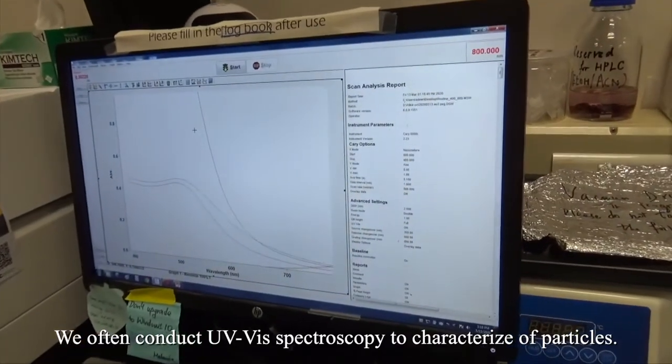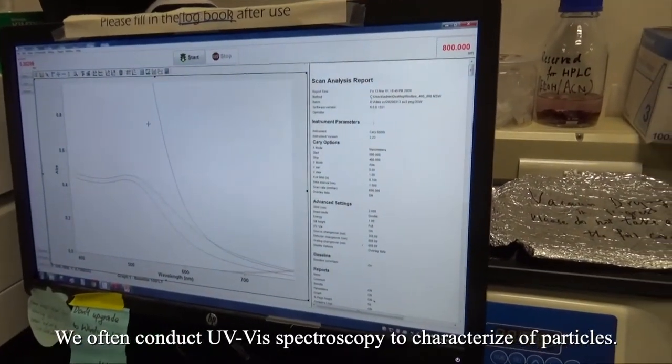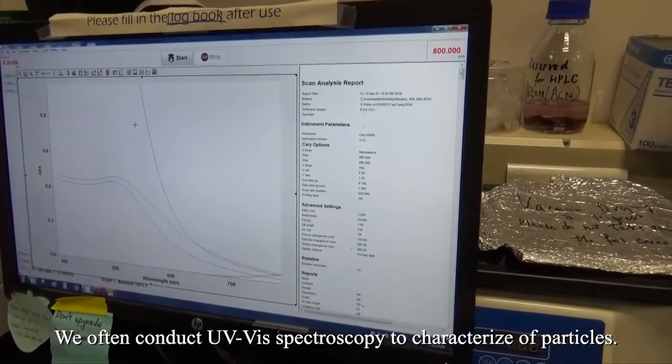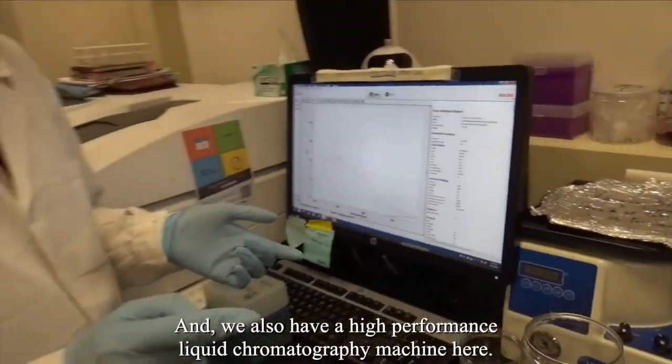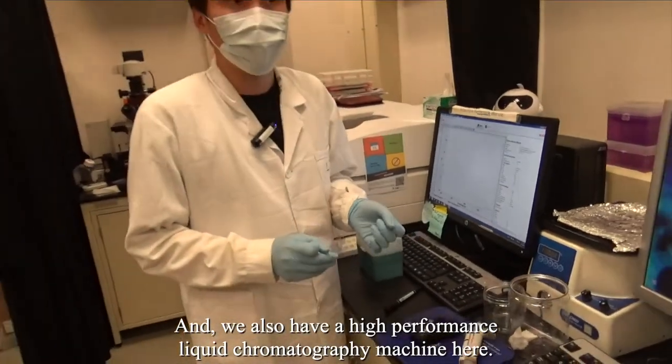We often conduct UV-Vis spectroscopy to characterize our particles. And also, we have a high-performance liquid chromatography machine here.